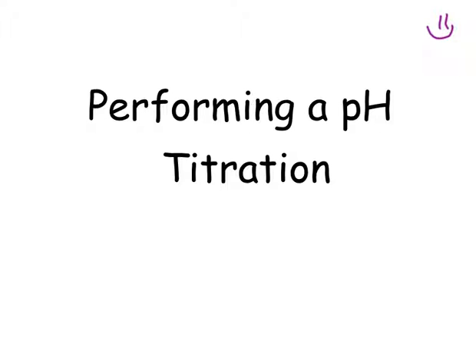Titrations are very, very big in AP Chemistry. This is our very first one, so we're only going to do 2 trials. We're going to give you a day for each trial, so I'm hoping to alleviate your stress level a little bit, but I can't stress to you how important it is to understand what's going on in titrations as well as know how to use the equipment.